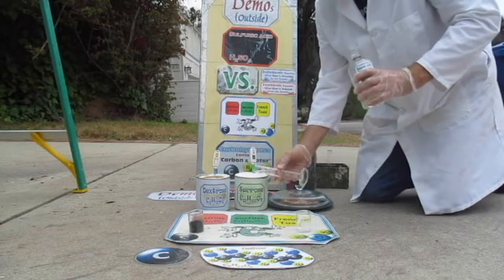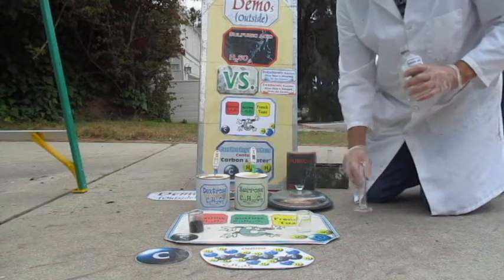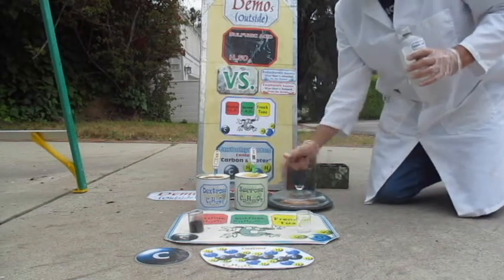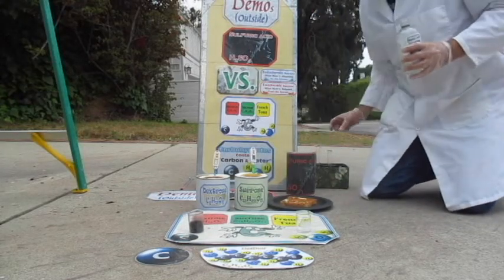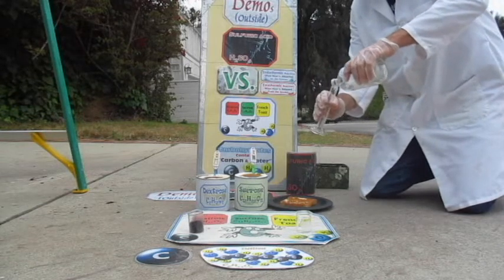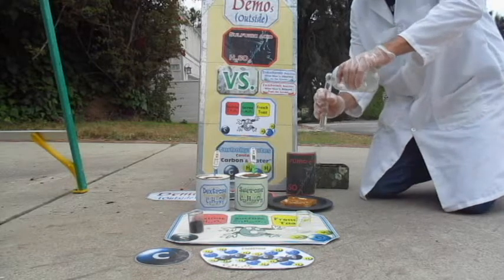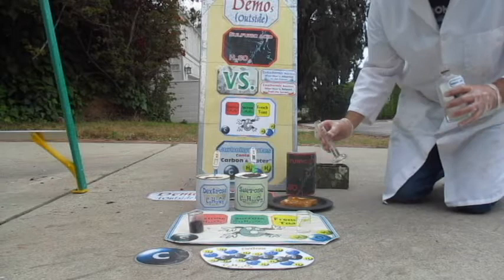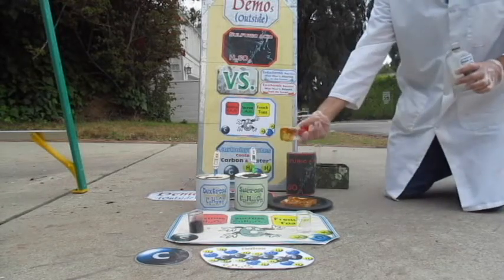There's another 50 milliliters. Oh, and why do I have French toast? Well, hasn't your mother or father ever told you that French toast is all sugar? So let's see if that's true. I don't need as much, so I'm gonna pour a smaller amount in here. I'm gonna try to write a letter on the French toast. Oh, that didn't come out so great. That wasn't as good.